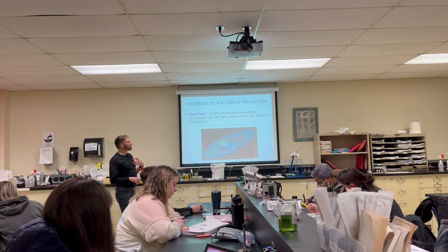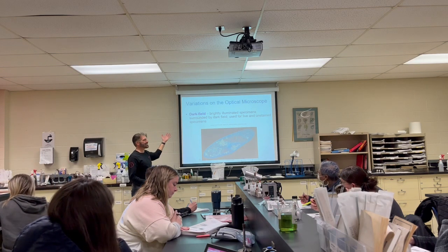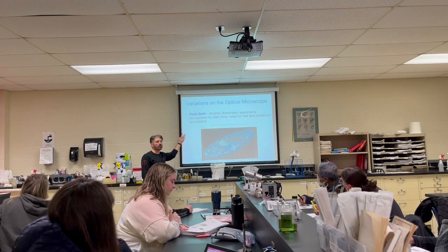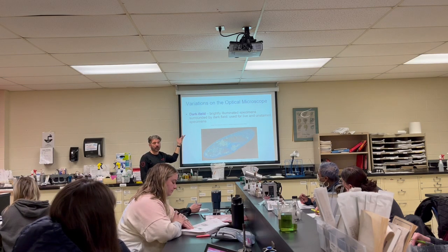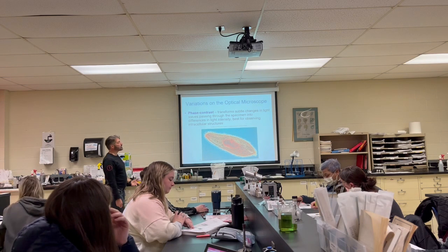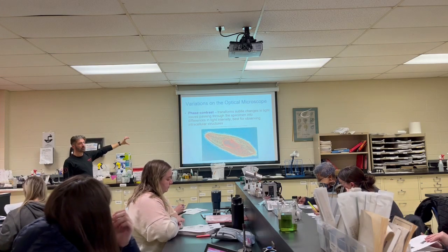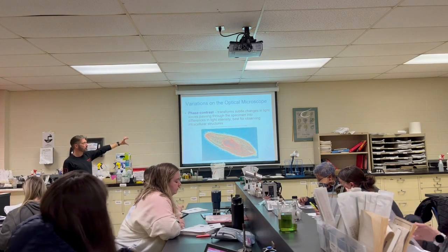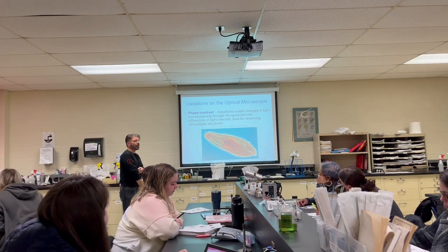So dark field, don't worry about this. I won't test you on it, but you have seen this in case it pops up on the exam after you leave here, on one of your NCLEX or MCAT exams or whatever they ask you. Right. Phase contrast, if you look, that gives you a much better 3D picture of what's going on in there. Right. And last week I said, if you look at bacteria, what don't they have?